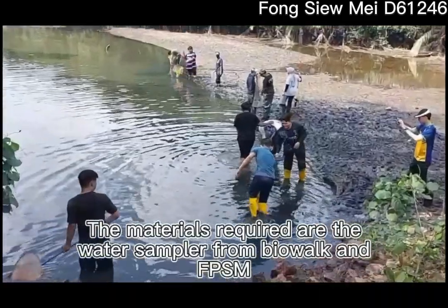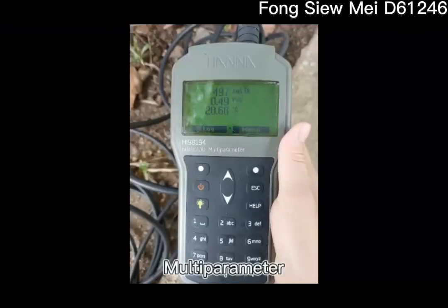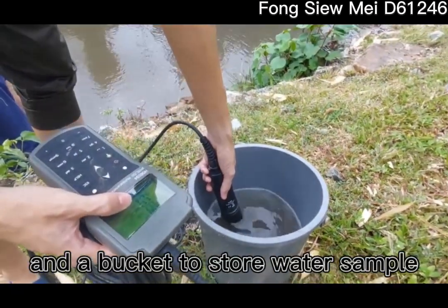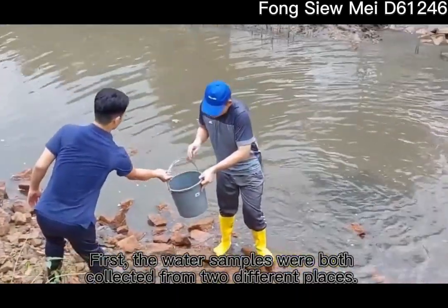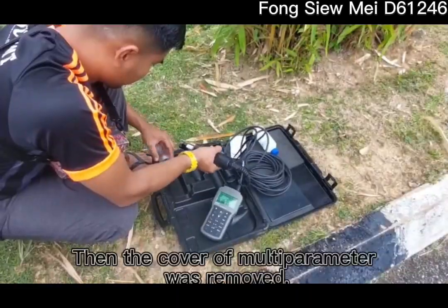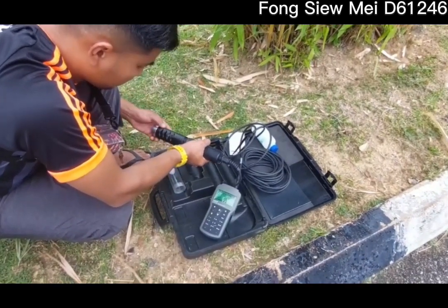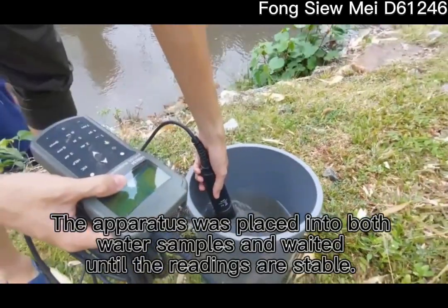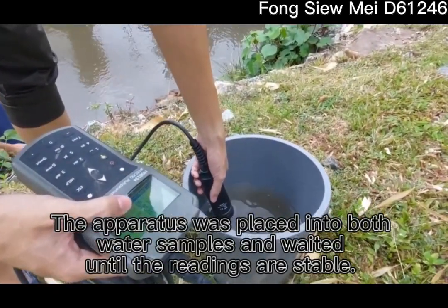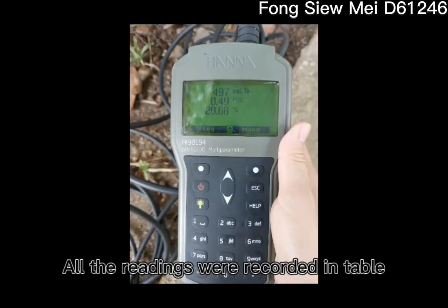Methodologies. The materials required are the water samples from Biowalk and FPSM, a multi-parameter, and also a bucket to store the water samples. First, the water samples were collected from two different places. Then, the cover of the multi-parameter was removed. The apparatus was placed into both water samples and we waited until the readings were stable. All the readings were recorded in a table.